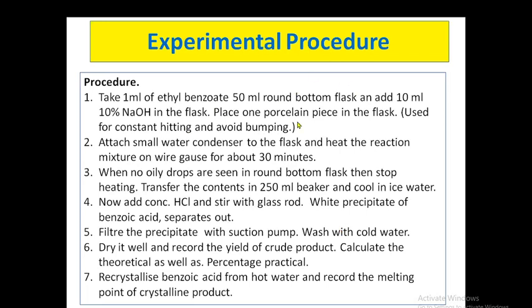Let's see the experimental process. First, take 1 ml of ethyl benzoate in a 50 ml round bottom flask, then add 10 ml of 10 percent NaOH. Place one porcelain piece in the flask for constant heating — it also avoids bumping. Then attach a small water condenser to the flask and heat the reaction mixture on a wire gauze for about 30 minutes.